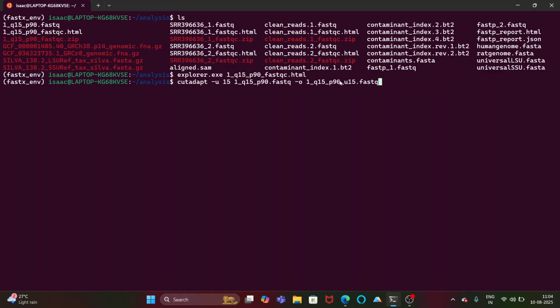So based on the additions of commands that are present within each file, you can understand, okay, these are the commands that I used, and this is the input file that I used, and from this input file I have generated this output file. So that gives you the flexibility to know what you have done. That's why I prefer this particular naming of the file, because it is quite understandable. You can use it on your own, no issue, but based on your comfort you can name the files, no issue at all.